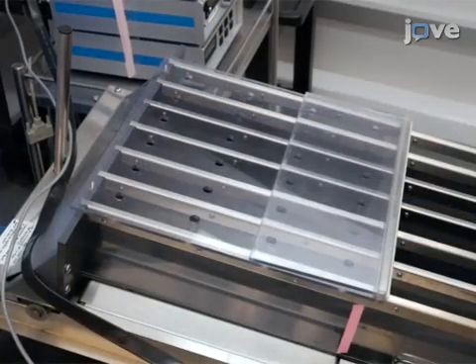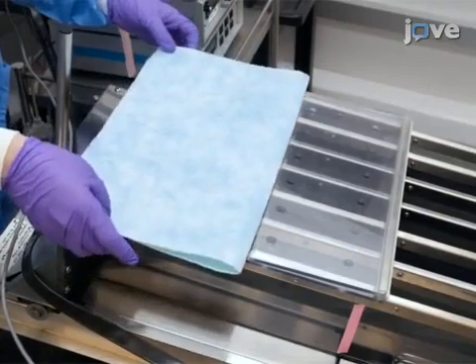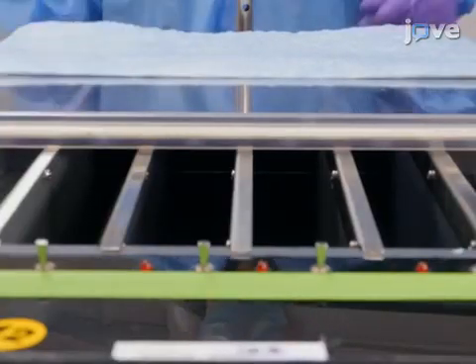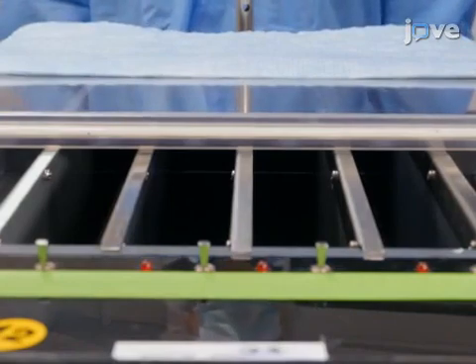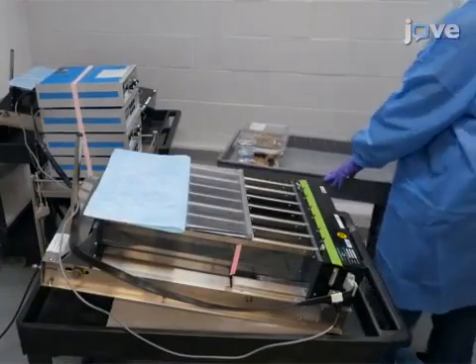Then, place a pad over one-third of the treadmill housing furthest from the shock grid to create a darkened space and entice the mice to stay in that area. Now, proceed with training the mice.